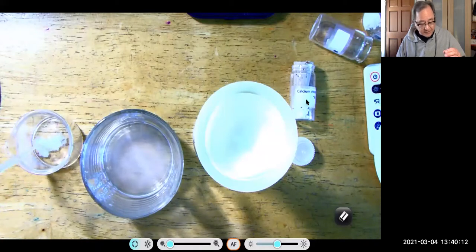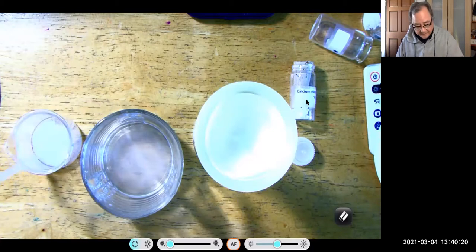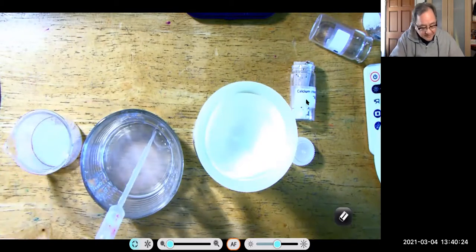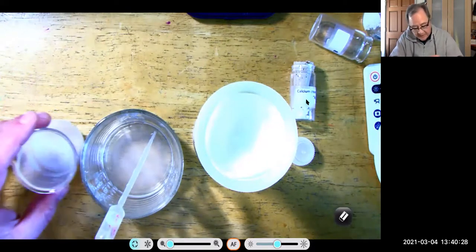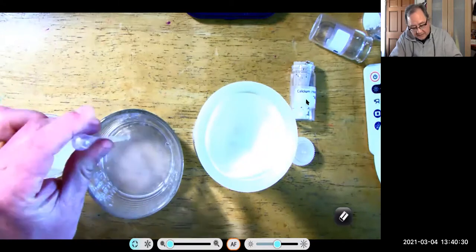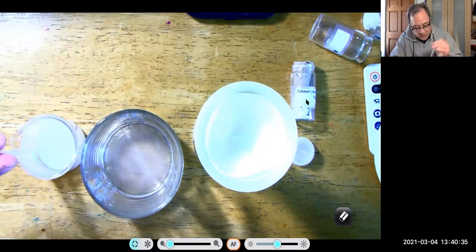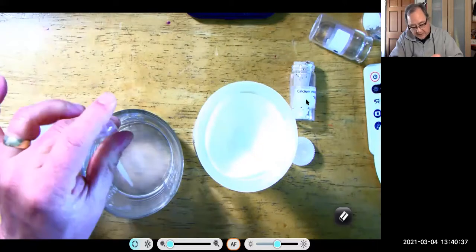Can you see what's happening? I'm getting a precipitate. That precipitate is, sodium carbonate, excuse me, that precipitate is calcium carbonate. I want to add enough of my calcium chloride to precipitate all of the calcium carbonate.